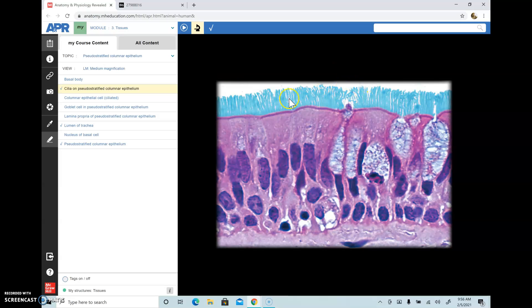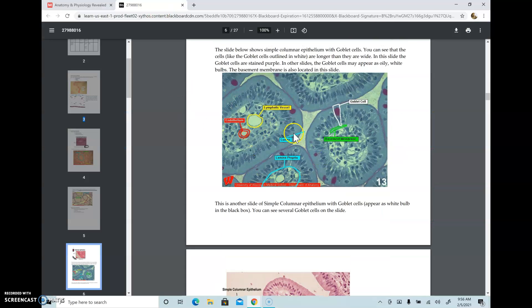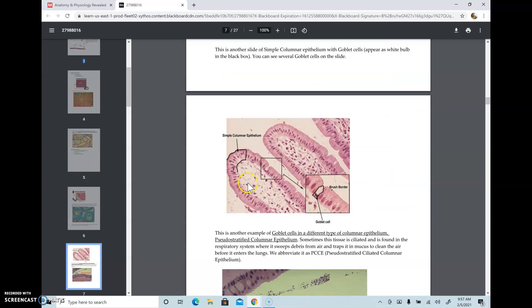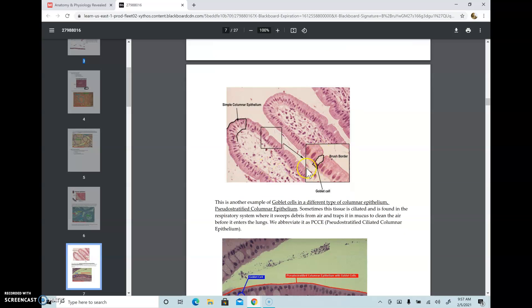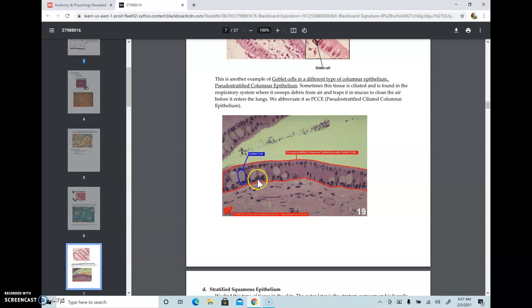The cilia are very prominent in this picture. This is the lumen, this is the apical or luminal surface, and this end becomes the basement membrane. Looking at the handout, you can see columnar epithelium where the goblet cells containing mucus appear very dark. One picture shows simple columnar epithelium with goblet cells and microvilli on the surface, and the other shows pseudo-stratified columnar epithelium, which you find in the trachea and upper respiratory tract.